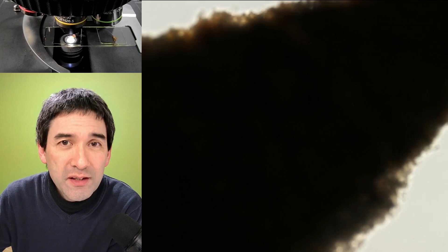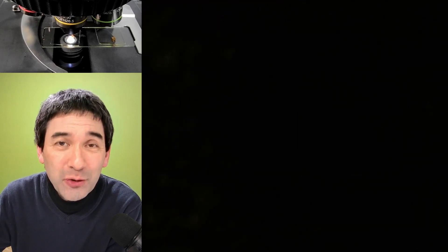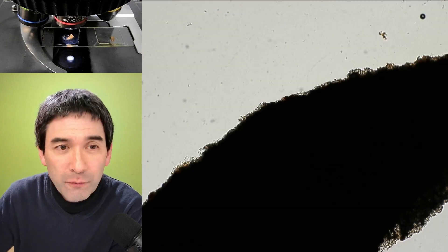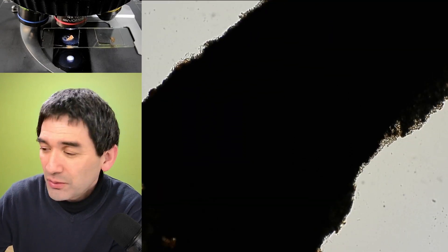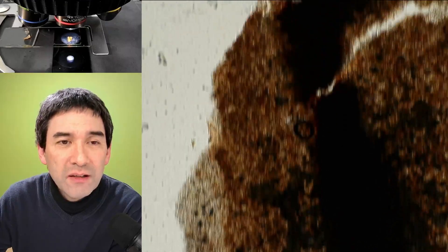By the way, these two pieces of specimen were right next to each other, so they're not from different parts of the peanut, but actually from the very same, very similar area. So basically, this is four times, four times objective. So you see, too dark to allow any light to go through, and here, significantly, significantly brighter.